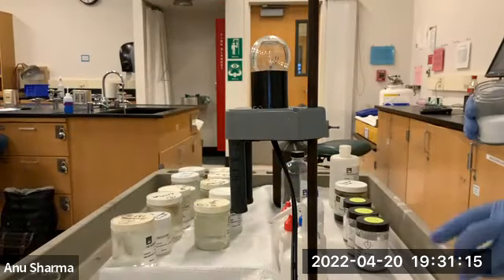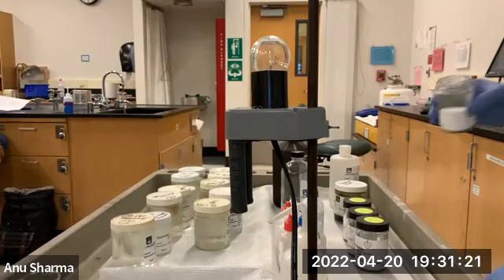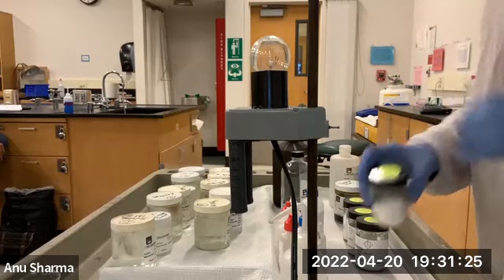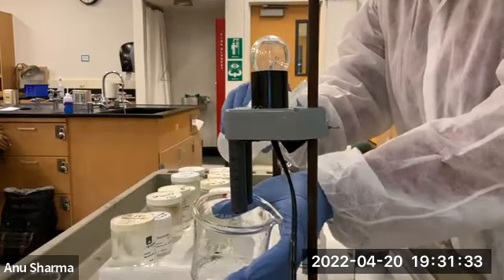Solid. Are you skipping the second? Pardon me? Oh, sorry. Yeah, sorry about that. I did skip. Okay, let's look at the next one. Barium hydroxide and sulfuric acid. Okay, yeah.